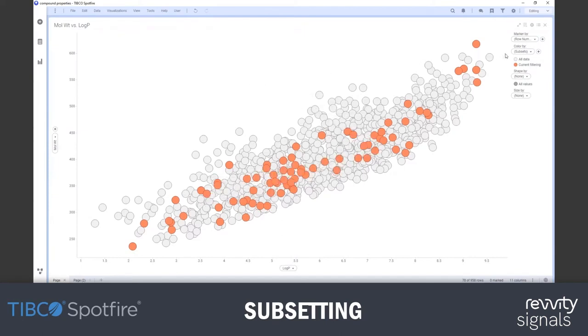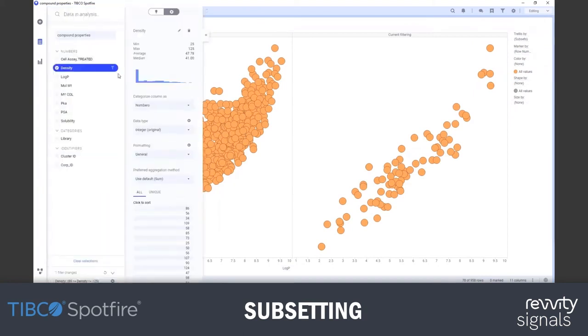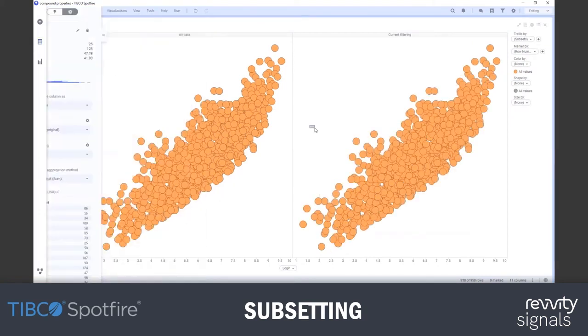And you can use those subsets in lots of different ways. Here, if I didn't want to see it by color, I could separate them out into two panes, for example. So I can see now, this is my current filtering, this is all. And if I were to clear the filtering to the full data set, you'll see they match up.